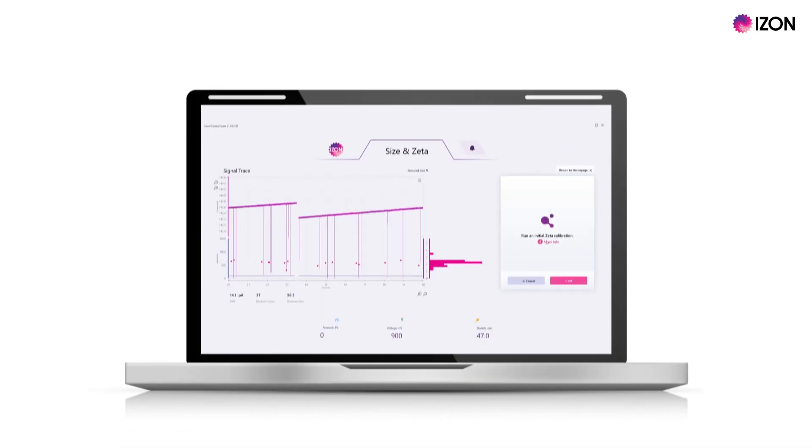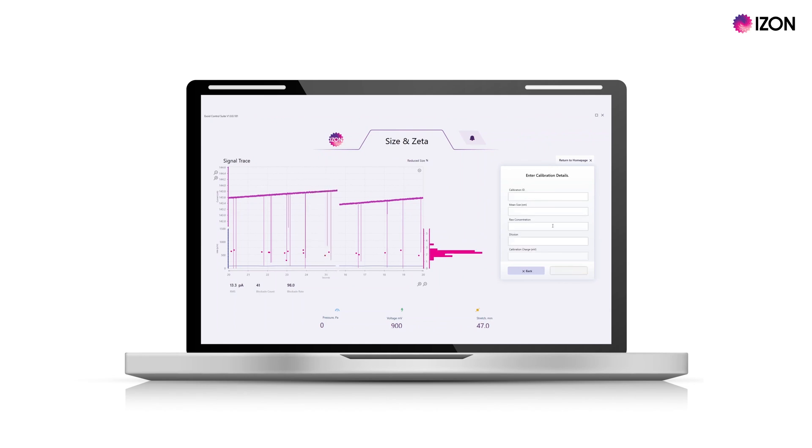You will now be prompted to run a zeta calibration. This involves the system measuring a CPC sample with a known surface charge at four different settings for reference. Select OK to start the calibration process.